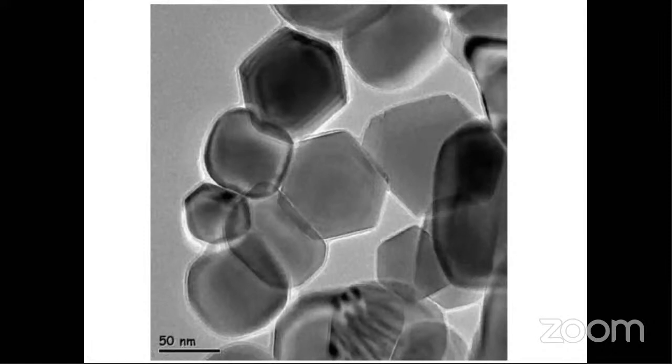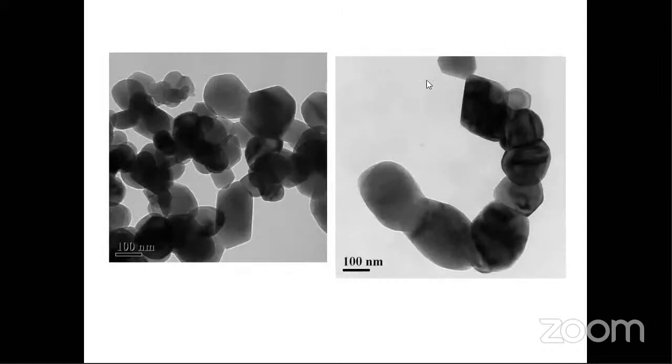This is the low magnification TEM of the same sample. And you see the lattice planes are quite clear. Here you see a sudden unstacking or breaking of the structure. So these are the things that can be clearly observed from TEM that is not possible to study in SEM.